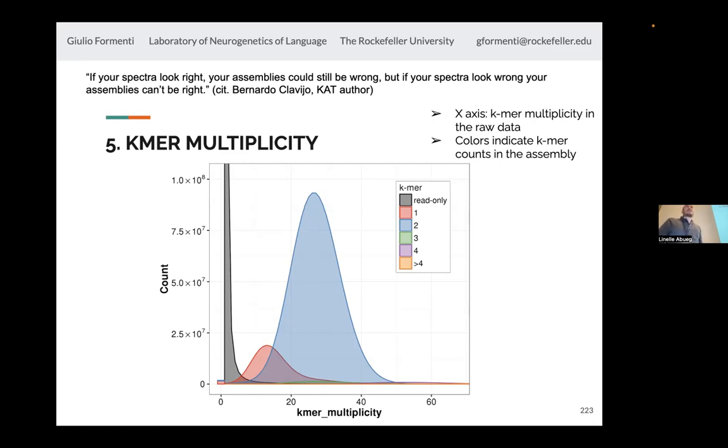Make sense? Well, I guess what's confusing to me, if it was duplicated in the assembly, why are there 4 copies of it in the assembly? Why just 3? Oh, okay. Well, it's only duplicated in the primary, so it's duplicated in either the primary or the alternate. And you could also have sometimes 4 copies as well.